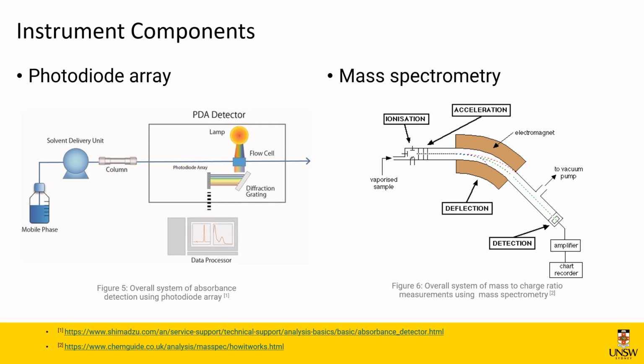The same solutions measured by the photodiode array then enter into the mass spectrometer, where they are ionized and the ions of different masses are measured for the mass to charge ratio. Simply, the combination of the two analytical techniques allows us to determine the amount of light absorbed, then the mass of the ions that absorb that light. When performed on an unknown species, it does not amount to anything, where at best, guesses on what it is in the sample can be made based on the mass to charge ratio.